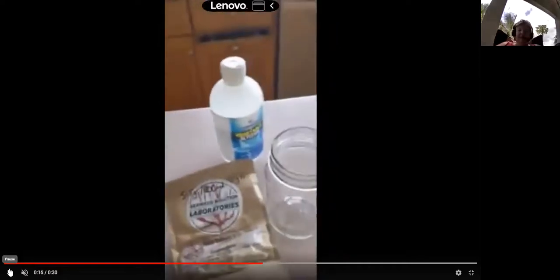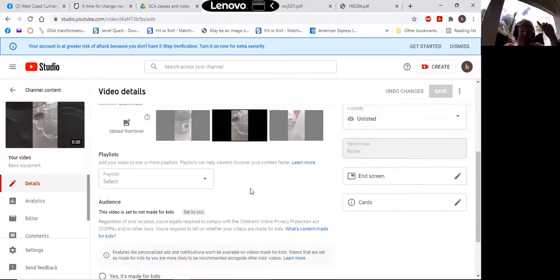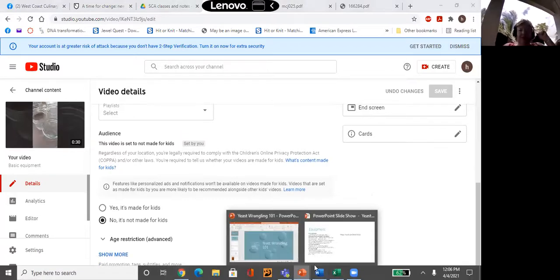So if you're going to prepare yeast at home, there's some basic equipment that can help you do it. I'm pretty sure many of you recognize what I've got right here, the Instant Pot or other electronic pressure cooker. You need something that will raise the pressure. You need malt extract. You need a scale. You need agar. You need canning jars, glycerol, and you might need little plastic storage vials if you're going to store yeast for an extended period of time. Additionally, you will need plastic plates for making agar plates. Okay, so that's the first thing we need.